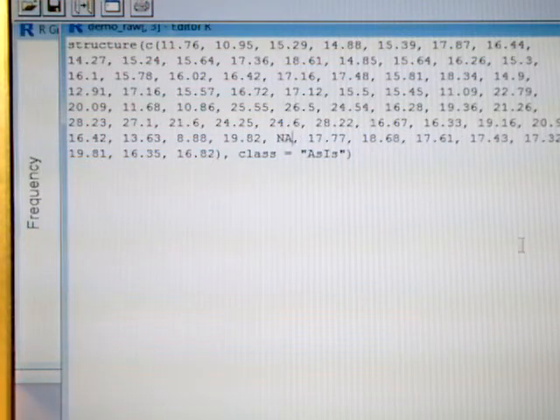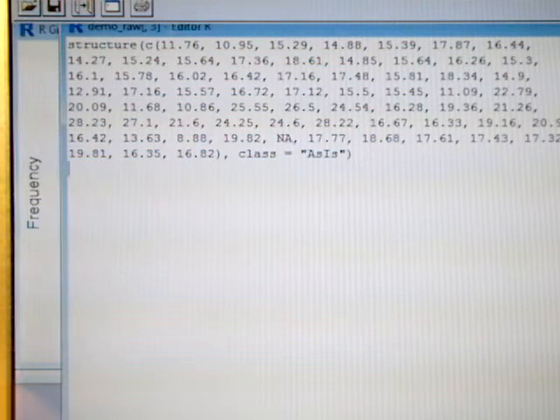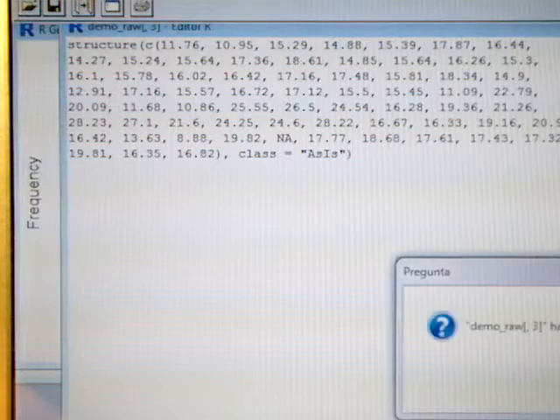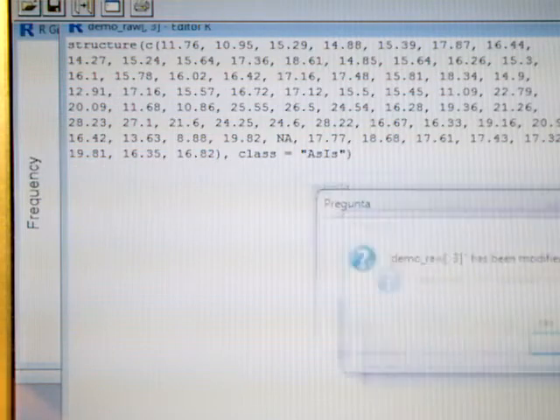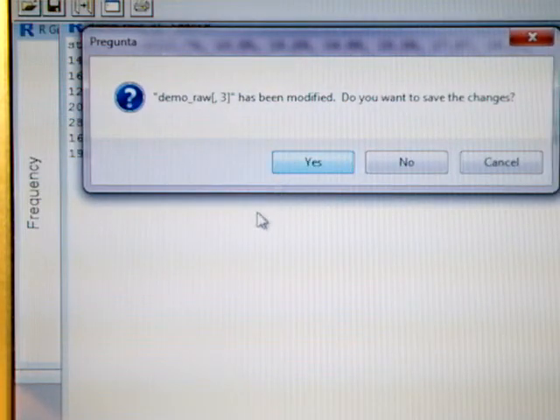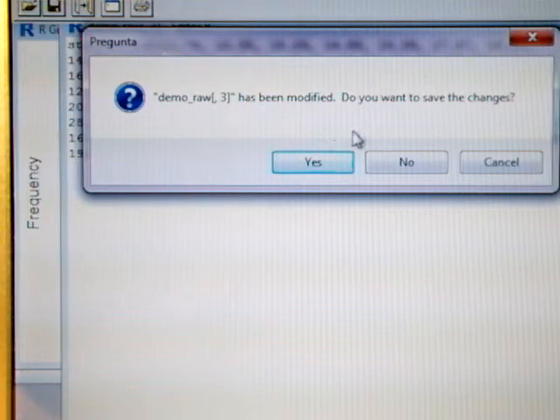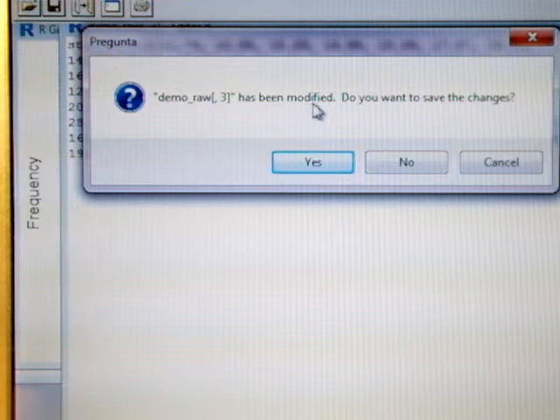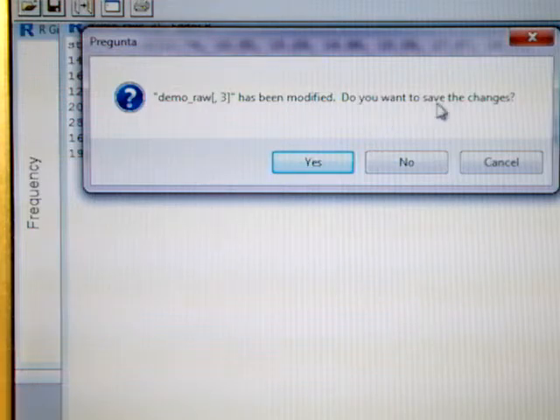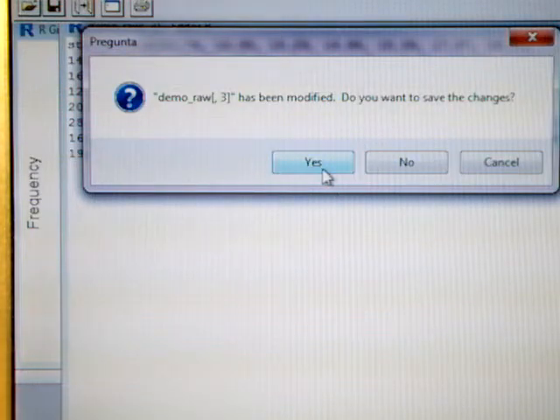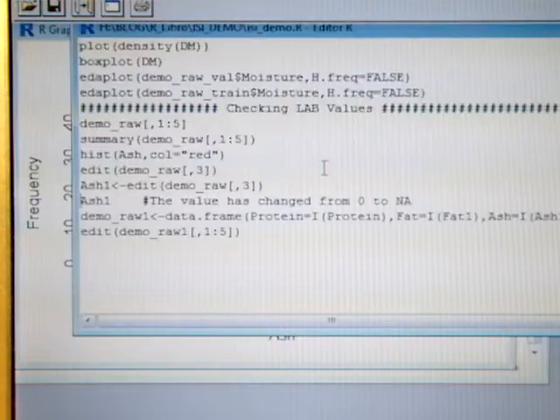We can close and ask if we want to modify or to save the changes, we say yes.